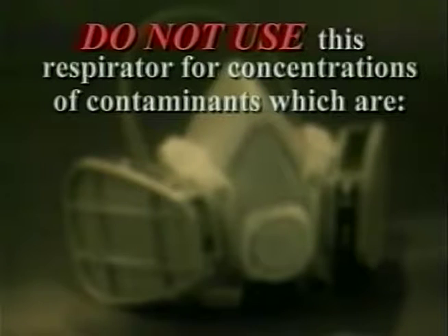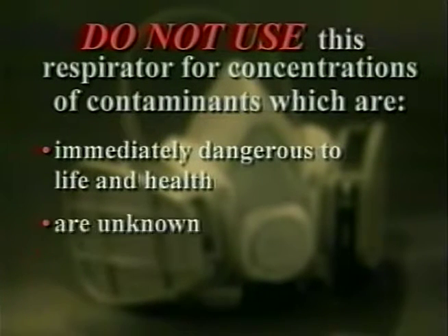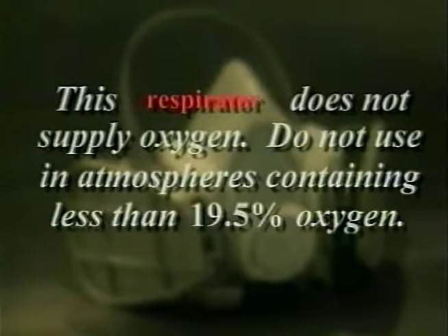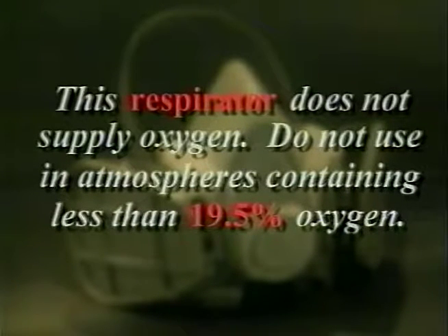There are severe limitations to the use of air purifying respirators. These respirators must not be worn when the conditions are immediately dangerous to life and health, the contaminant concentrations are unknown, or when the contaminant concentrations exceed 10 times the allowable exposure limit. These respirators do not supply oxygen, so do not use them when the oxygen level is below 19.5%.